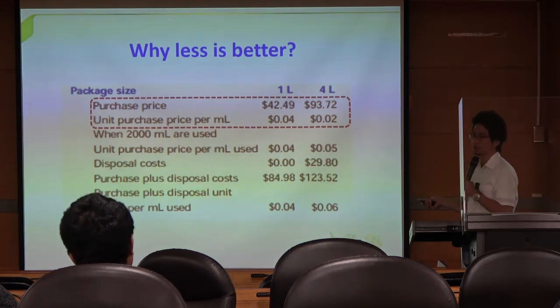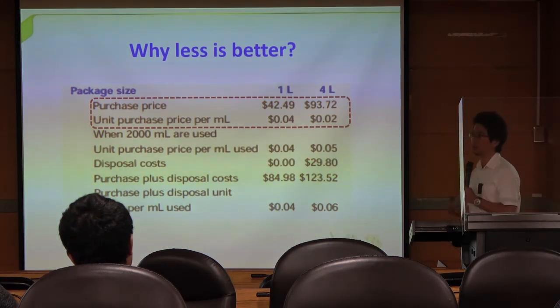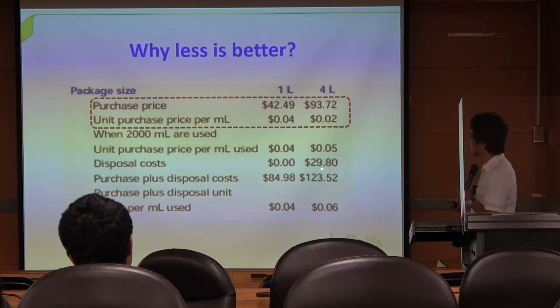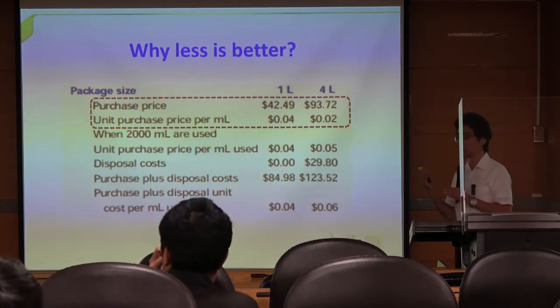This situation has now happened at my workplace. 20 years ago, lots of my former co-workers bought lots of reagents and stored them everywhere. Now the regulations in Taiwan are restricted, so we need to clean all the reagents. The disposal cost is very high, higher than buying a new one.